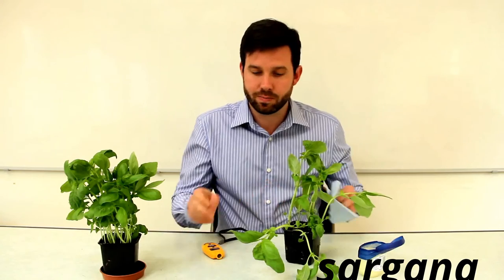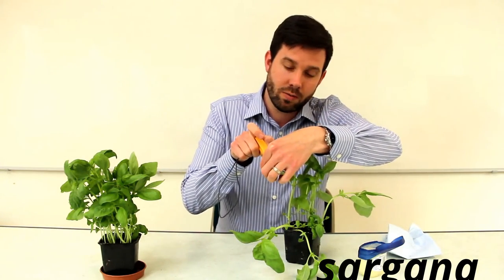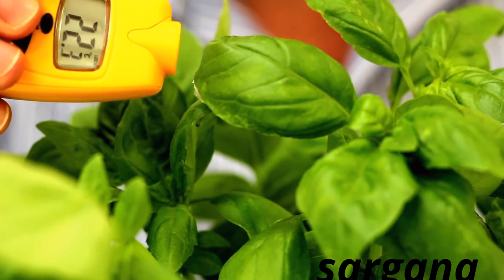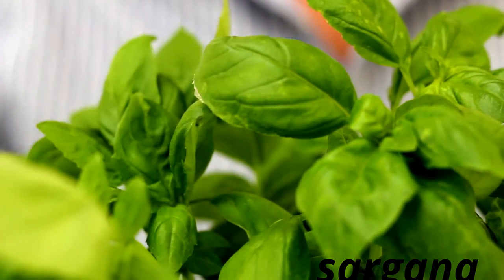The investigation is all about measuring the change in temperature of that leaf. If you take the temperature of the same leaf that you've applied the Vaseline to over a course of about 10 minutes, you'll find that the temperature of the leaf will increase due to the reduction in evaporative cooling on that leaf.